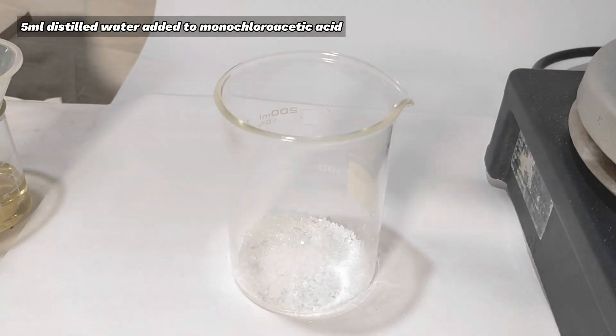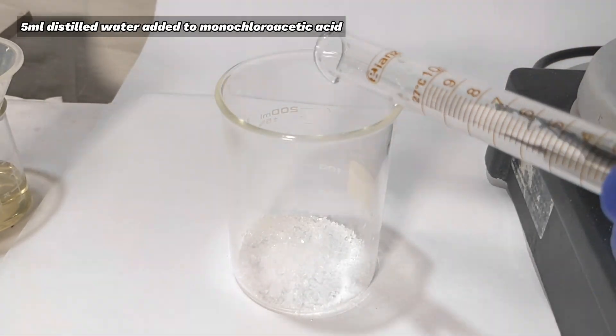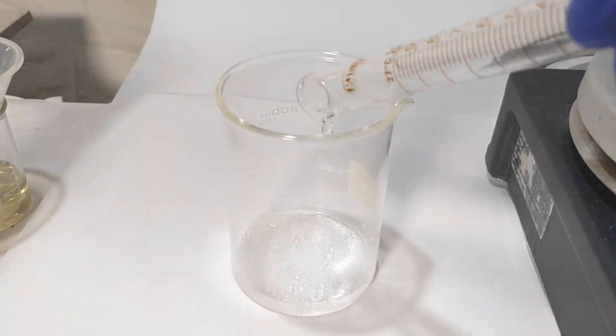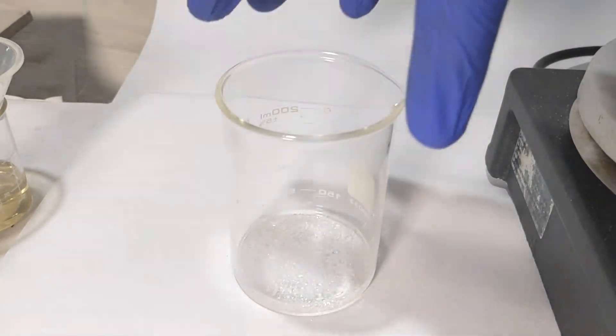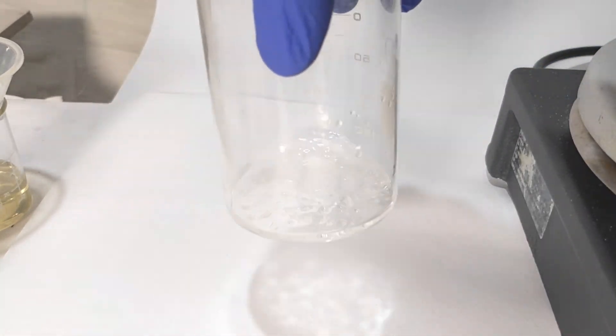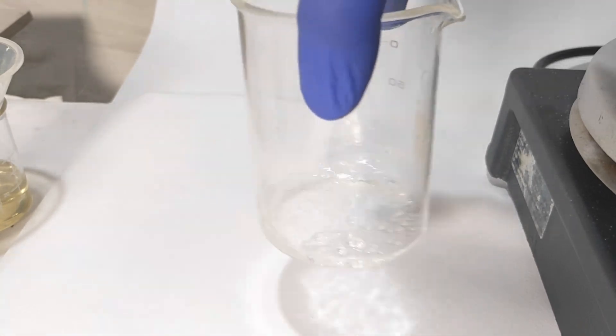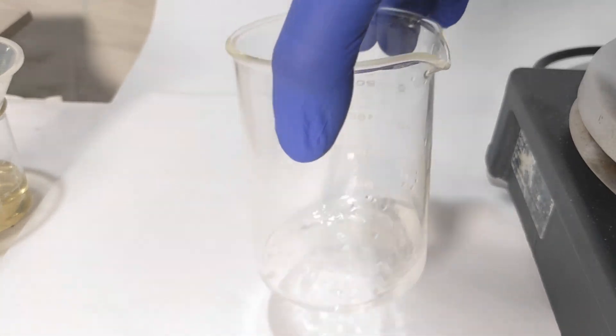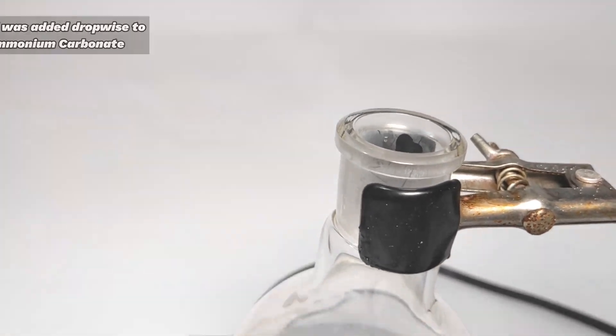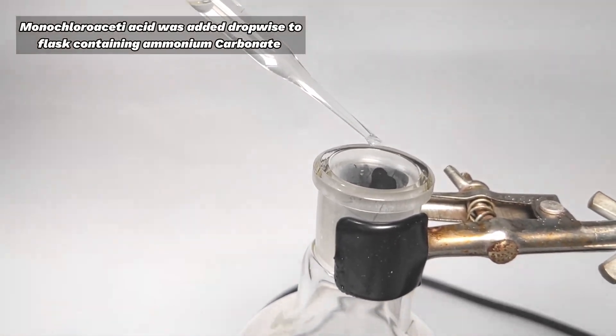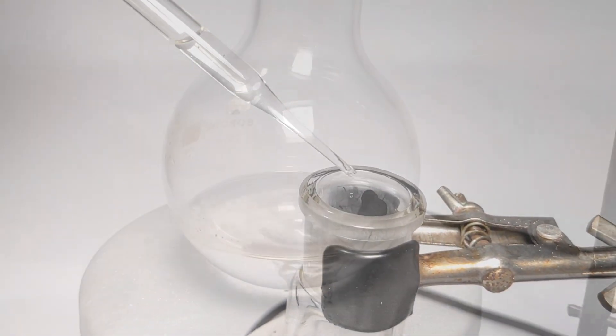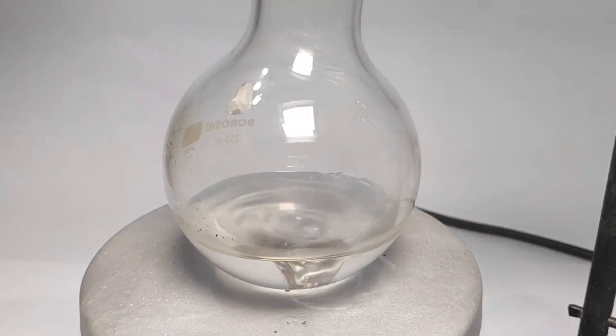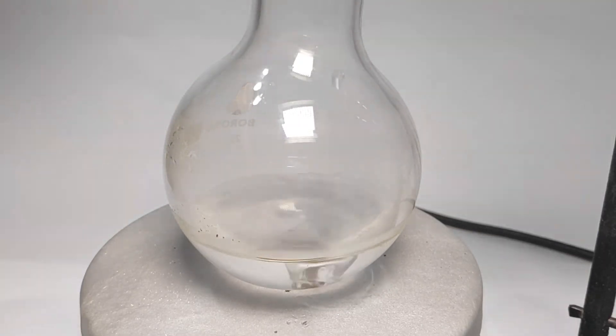5 milliliters of distilled water was added to the beaker containing monochloroacetic acid. The beaker was swirled gently and the compound easily gets dissolved in it. Using a pipette, monochloroacetic acid was added drop-wise to the flask containing ammonium carbonate. The flask was stirred throughout the addition. Dense white fumes of ammonium chloride was produced.